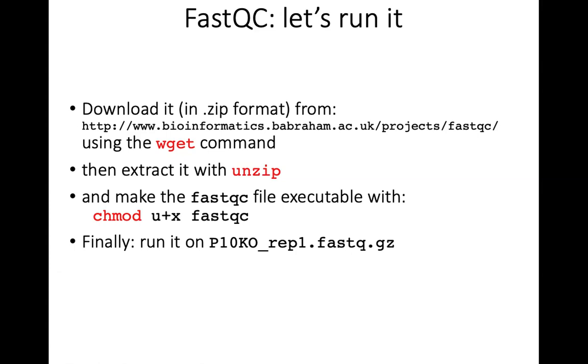Yes, you're downloading .html, that's not right. So the FastQC version 11.8 for Windows or Linux. Yeah. Change the focus to your browser window, and then copy the link. You want to use Control-C on the keyboard.